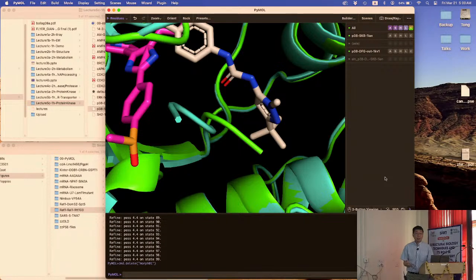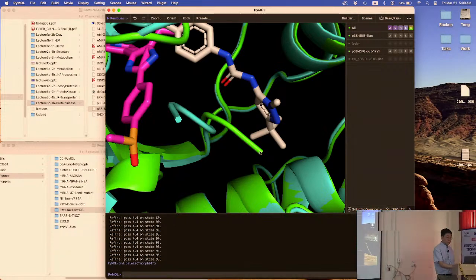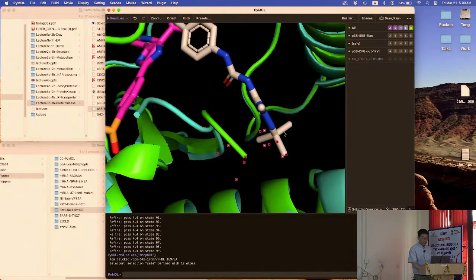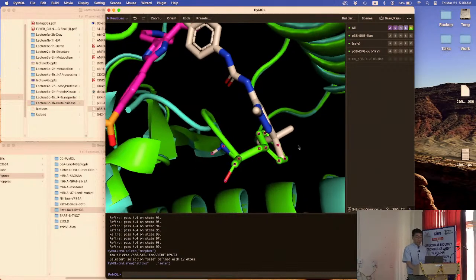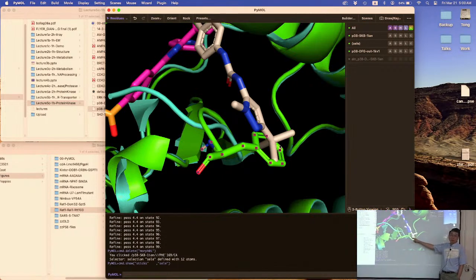Can you do the same thing? Okay? So now we know this is the phenylalanine. So that's the screen, the end of the screen structure is phenylalanine. So let's click on it. You see it is the phenylalanine. So we show that as sticks. You see something similar? And you can clearly see the phenylalanine side chain is clashing exactly with the T-butyl group, right? So the inhibitors utilize the phenylalanine binding pocket.